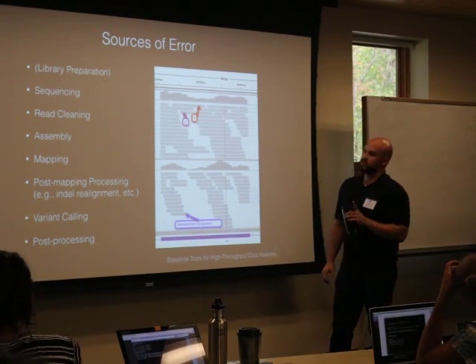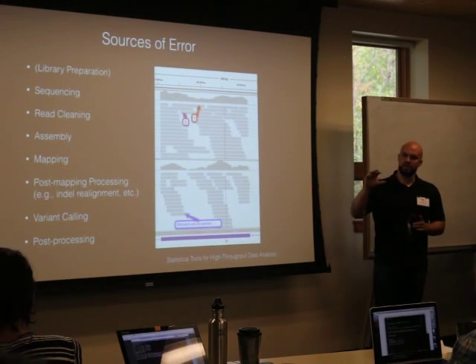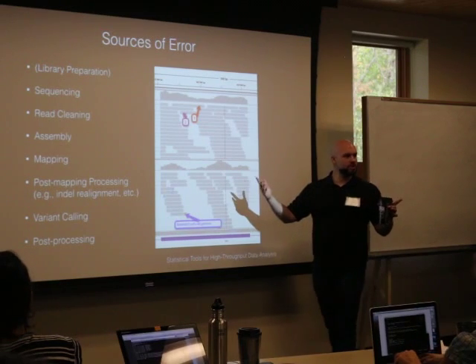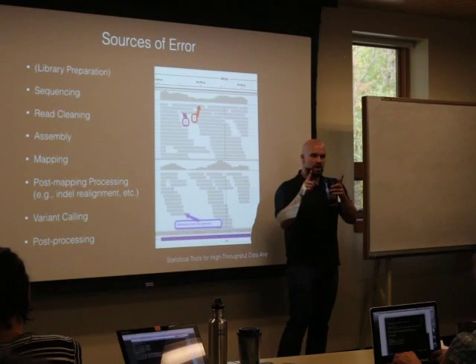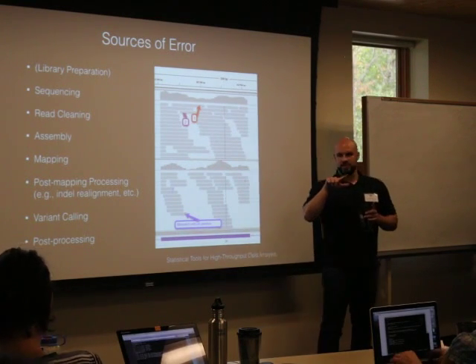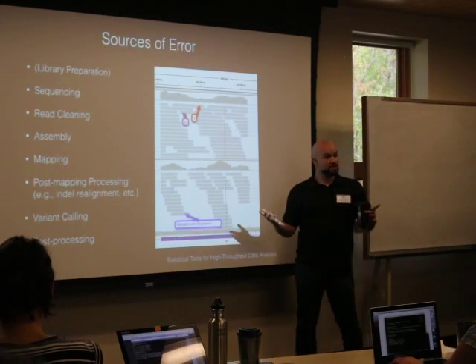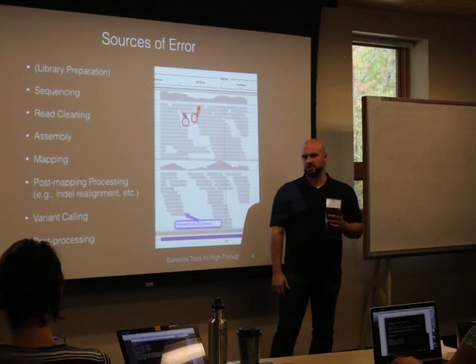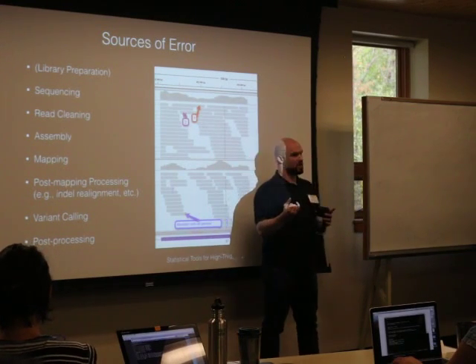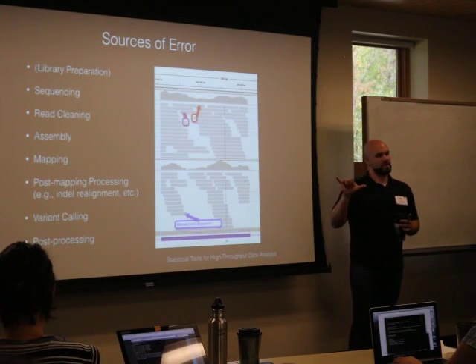Yeah, you can do GATK or other approaches, so there are other informatic ways where you don't necessarily need to go through. The way that some established algorithms deal with indel realignment is you identify where an indel is. You basically do a local reassembly of that particular area. That's if you're calling genotypes per position. If you're calling haplotypes using something like HaplotypeCaller, again in the GATK or in FreeBayes or other approaches, you actually get simultaneous calling of indels and your variants themselves by virtue of collapsing things into haplotypes, so into those extended stretches.